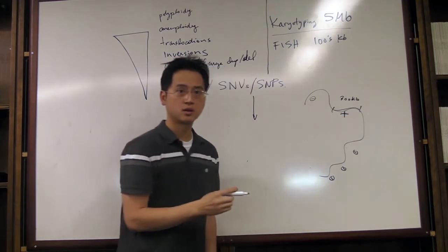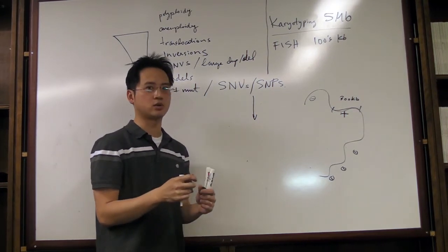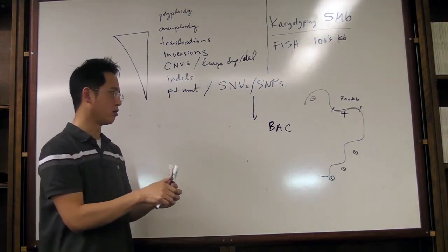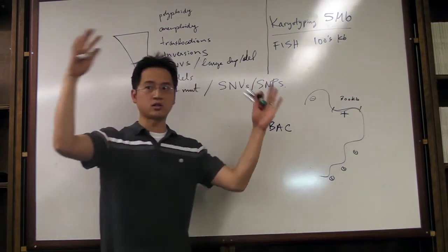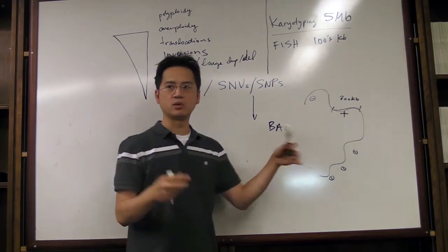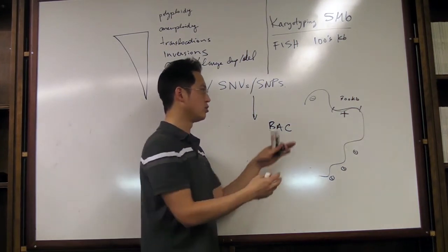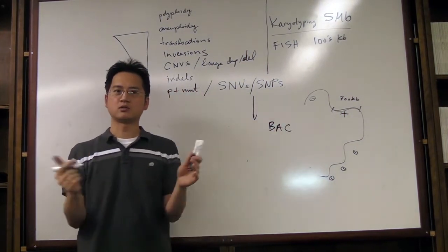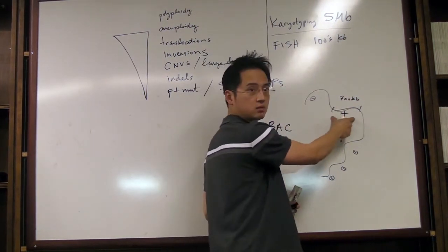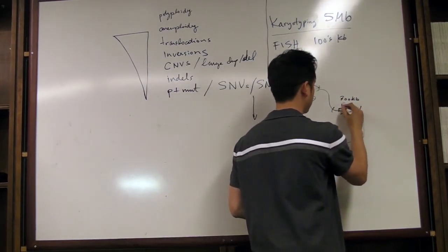Fortunately, from the Human Genome Project, we inherited a very useful substrate, which is bacterial artificial chromosomes. During the Human Genome Project, which I'll talk a bit more about later on, they developed these very large plasmids, circular DNA that can be grown in bacteria. They had to break down the genome into subsections so they could sequence it more easily by Sanger sequencing. So it's a hierarchical approach to deconstructing the genome into workable sizes. Because of that, we now inherit a clone that we know is this portion of the genome, because hopefully people have verified it by back-end sequencing. And we know it's going to target, for example, the EGFR gene that we're interested in.